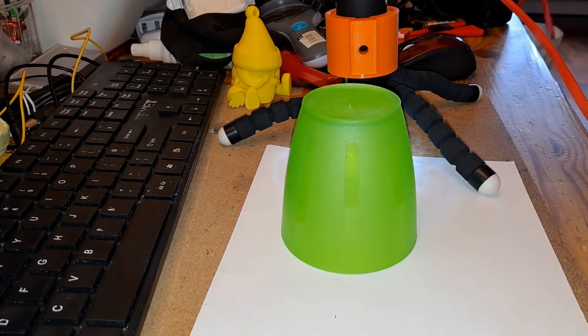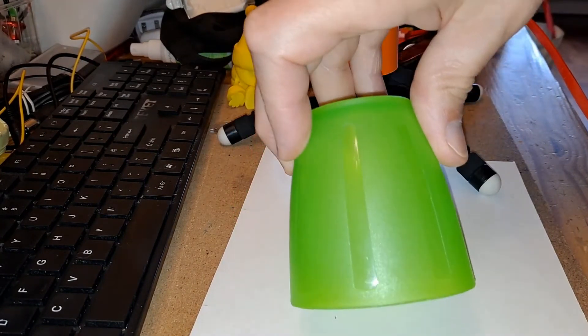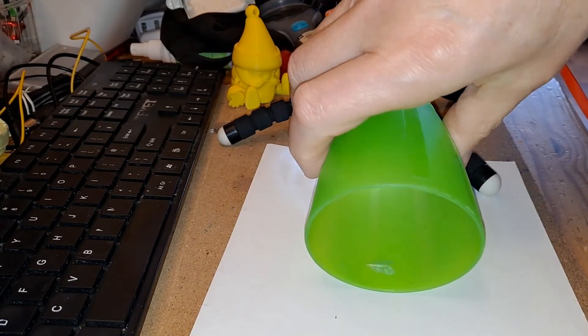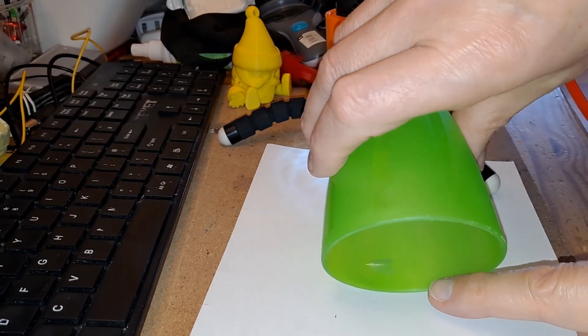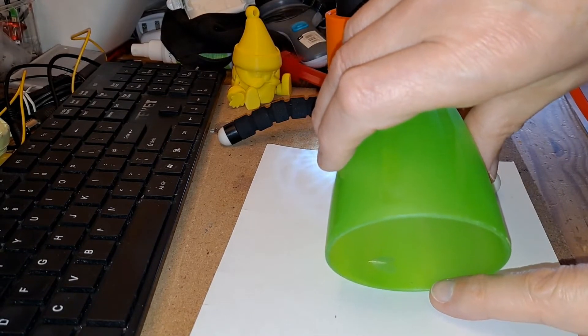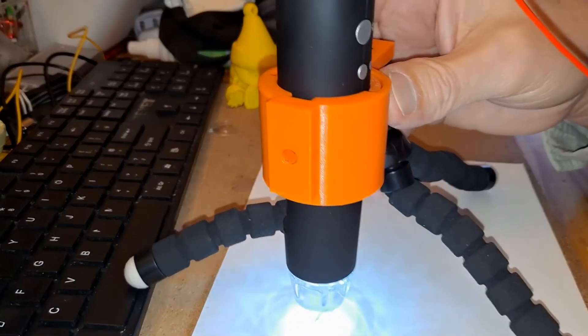Hi guys, I spotted a little bug — it's only a fly of some sort, just looks like a lacewing type thing. Thought we'd have another little go with the microscope if I can get it out, see if we can catch it before it runs off.